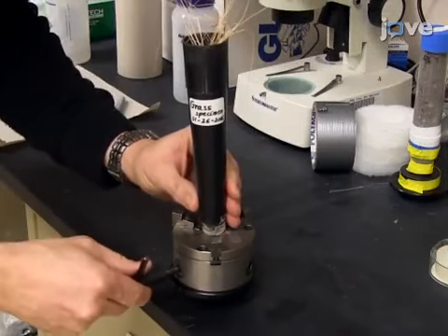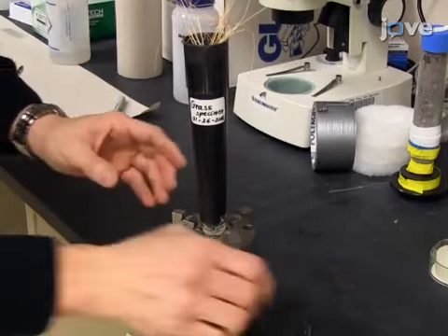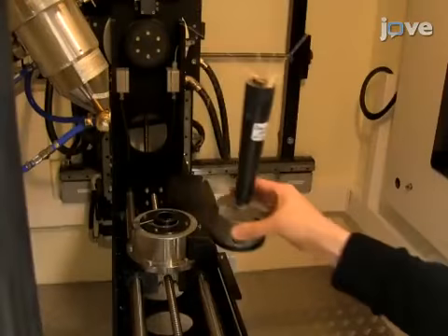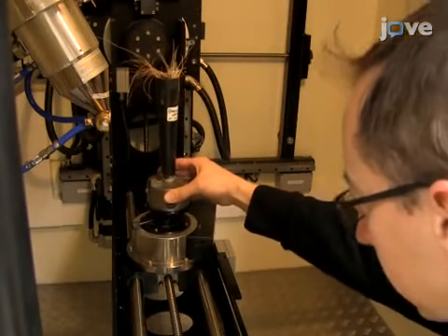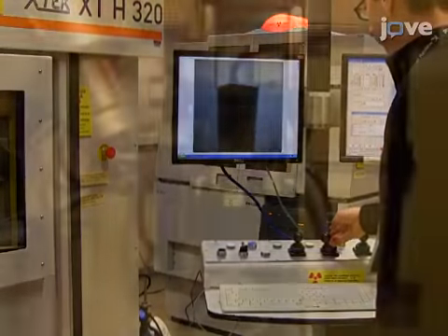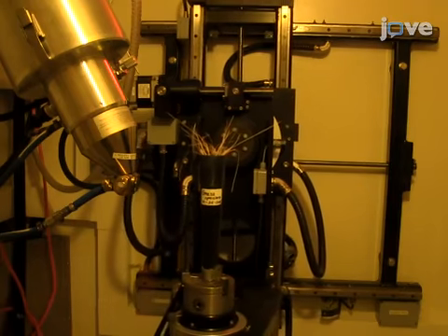To begin, place a potted plant on the sample manipulator of the X-ray tomography scanner at a distance desired for target magnification. For a plant in a 2-inch diameter holder, set a sample to a source distance of about 3 inches.